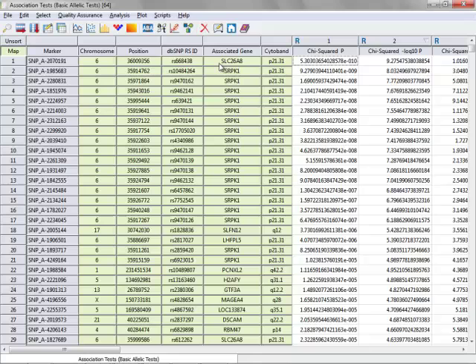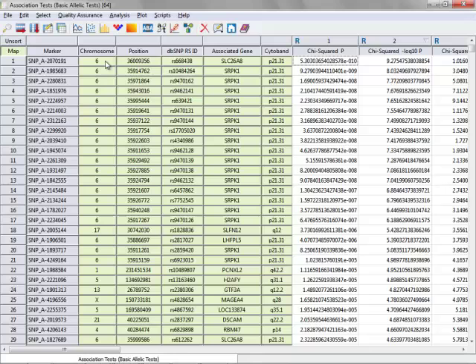If you want to investigate this SNP further outside of the software, you can always right-click on any of these green columns here and choose one of the databases that we support.